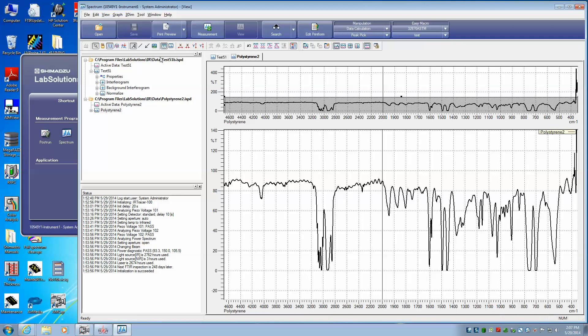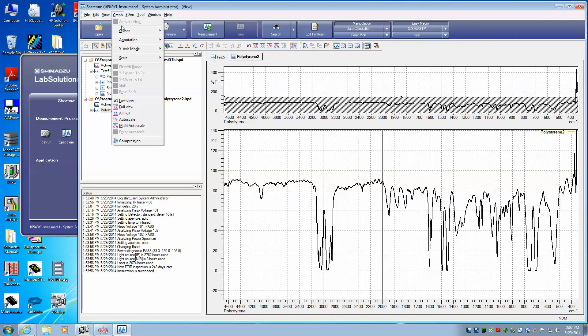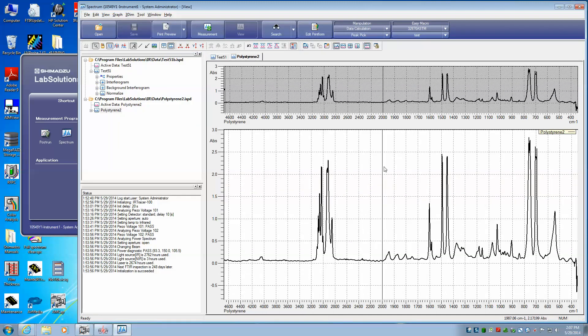All we have to do is go back up here to Graph, Y-axis mode, and now we'll select absorbance, and it's automatically converted to absorbance.